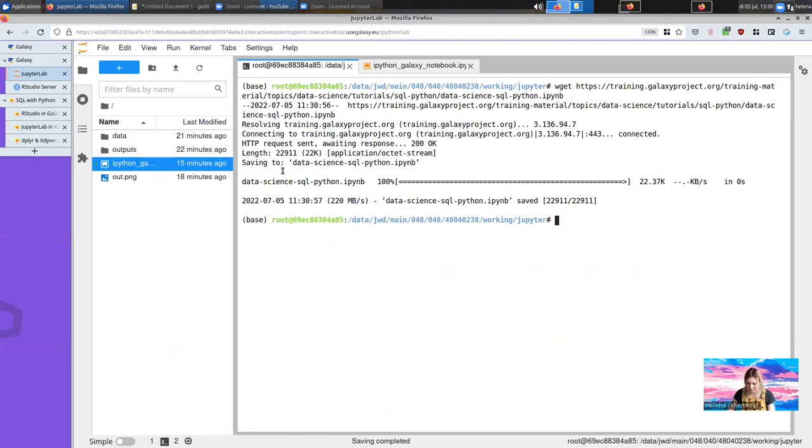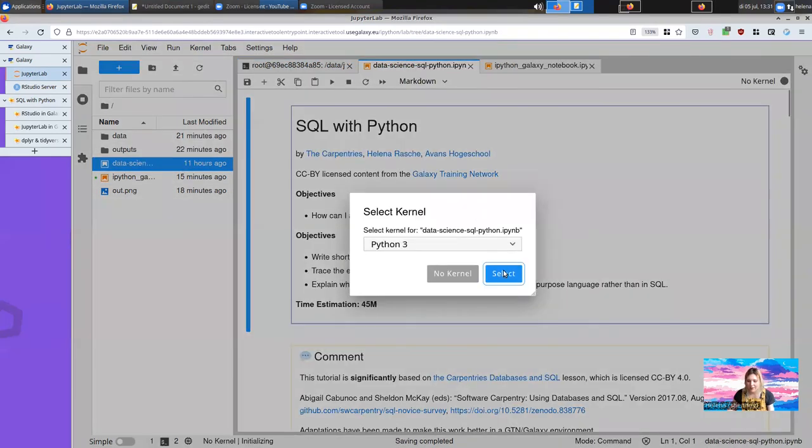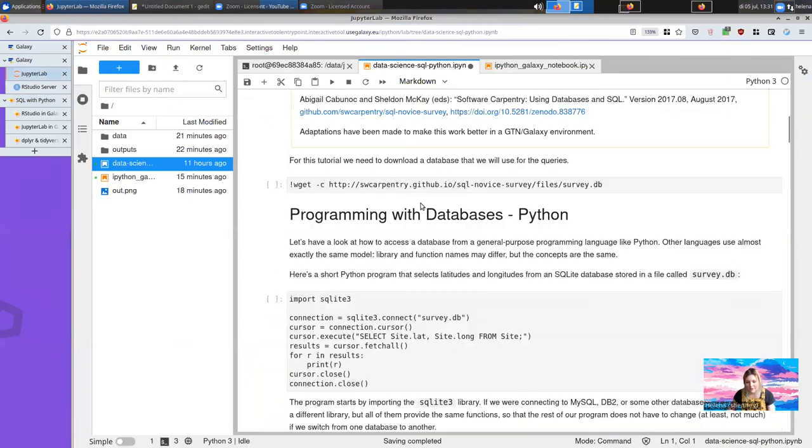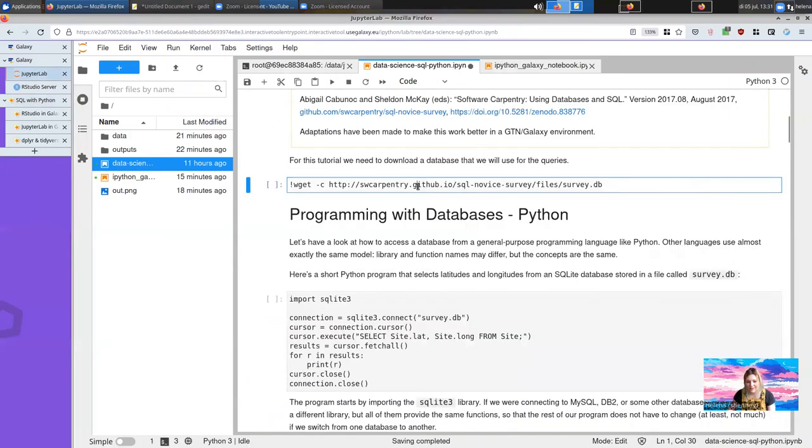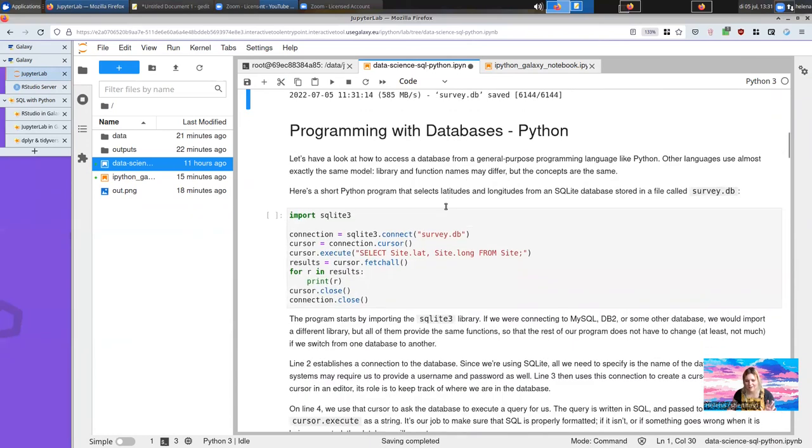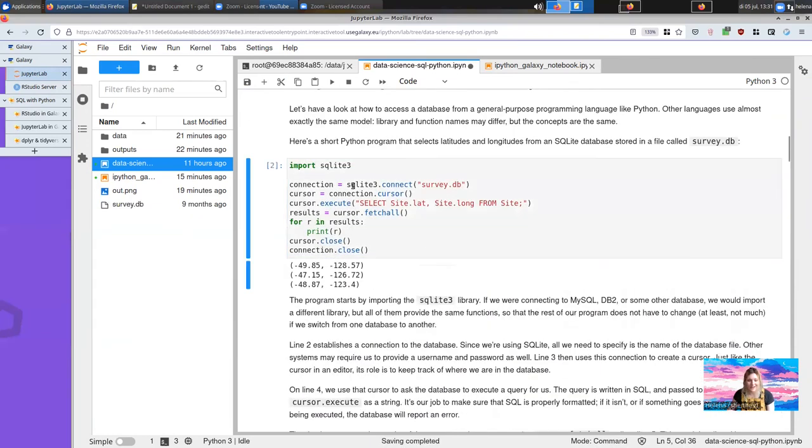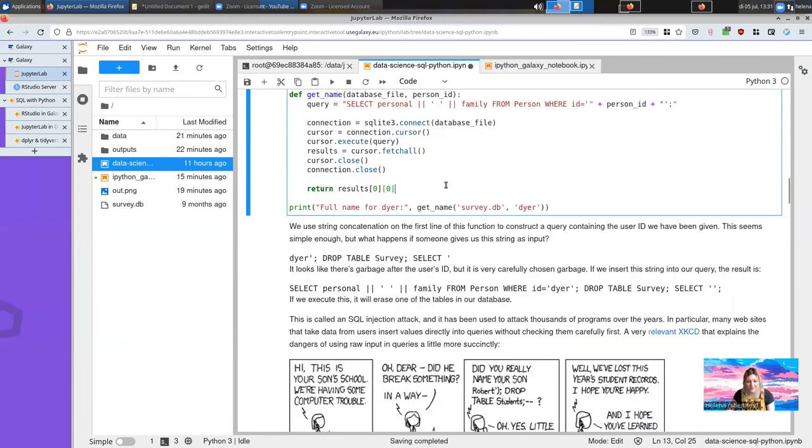Oh, I am. It's just not showing up here yet. Then you can open up these notebooks directly inside Jupyter notebook. All of these are Galaxy training materials up to the normal Galaxy training materials standards. And you can play around with the code.